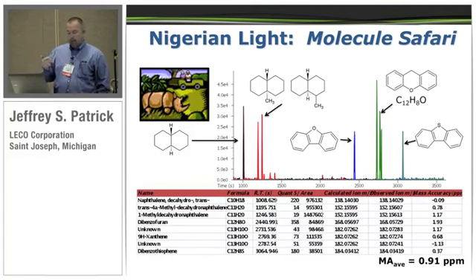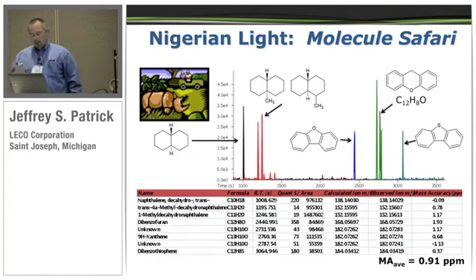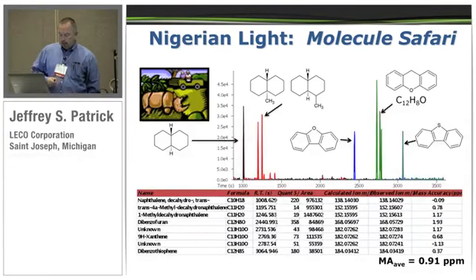And then finally, there's always other things in there that you don't expect, may not necessarily plan to characterize, but seeing them is always beneficial. It's usually, not always, but usually better to have more information. And these compounds, which were not necessarily targeted, but were found, were identified with the indicated mass accuracies, all shown here with this diversity of structure. And again, mass accuracies 0.91 for this class and suite of compounds.